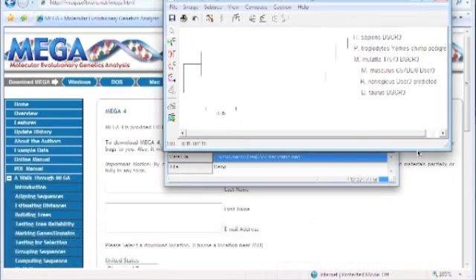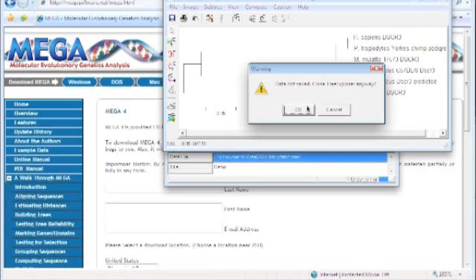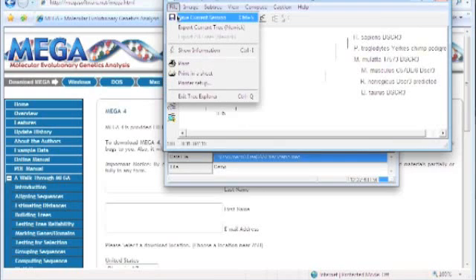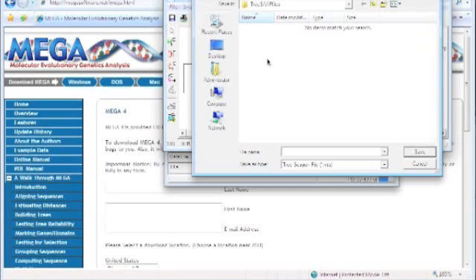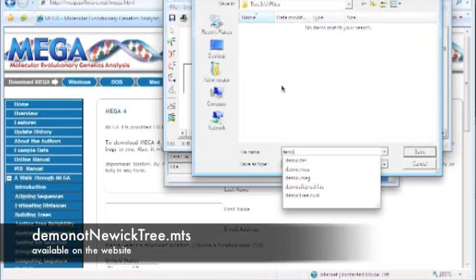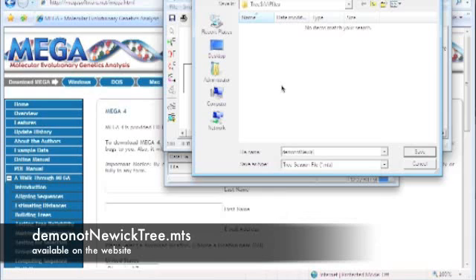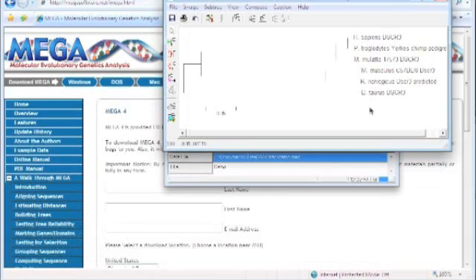I should probably name these more uniquely. But now that that's saved out, I'm going to save this in case you need it. So close that out.